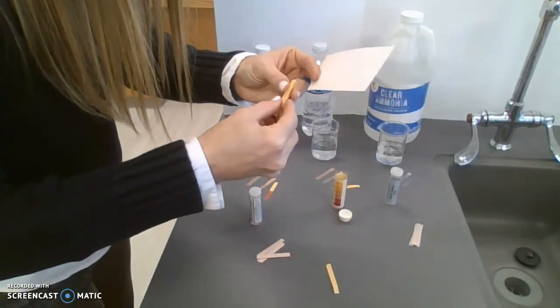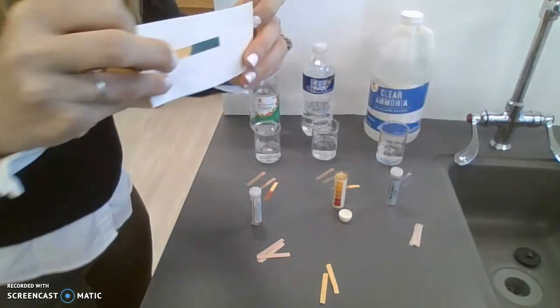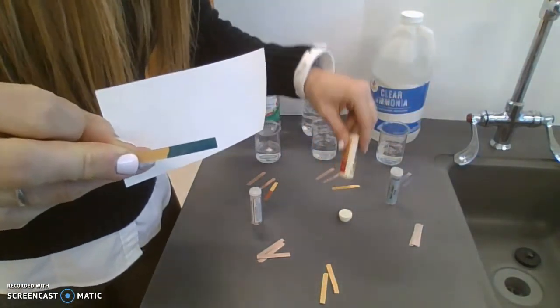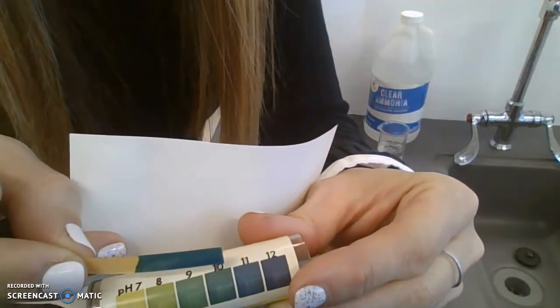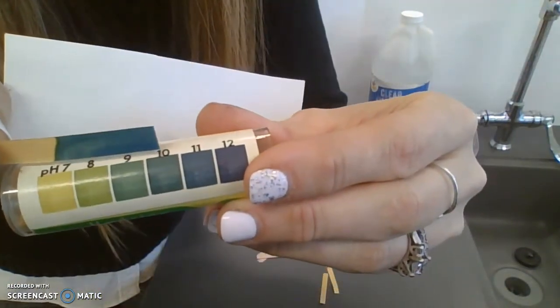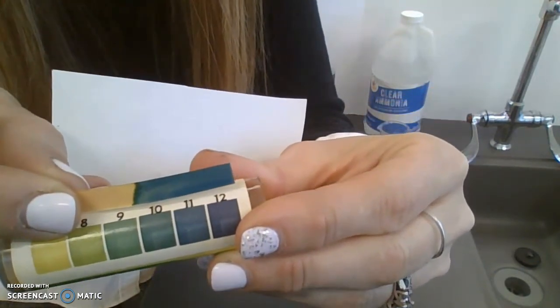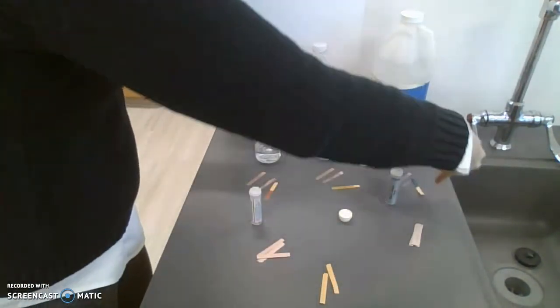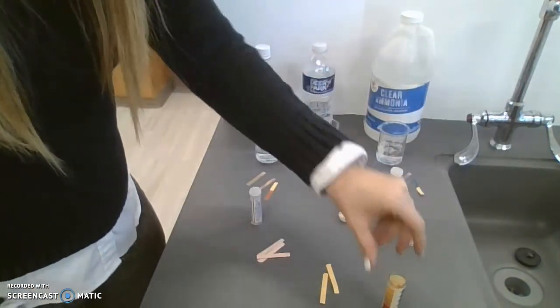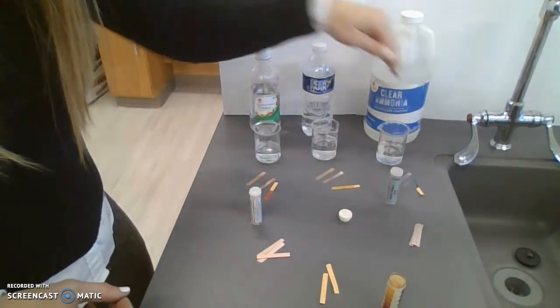And yellow litmus in the presence of the base turns it blue, showing us very close to a pH of 10 or 11 when it comes to our ammonia. So remember, bases turn litmus blue.